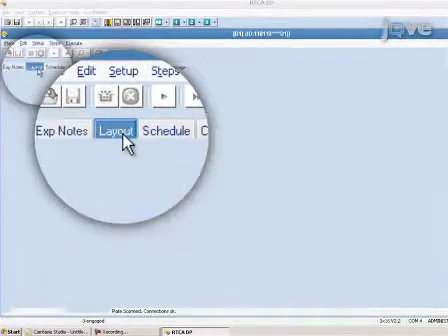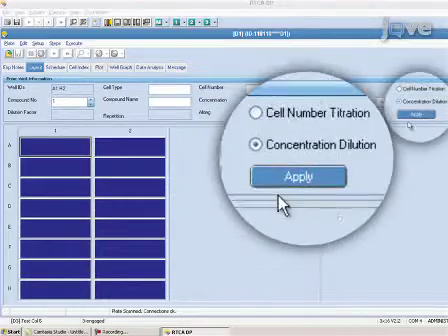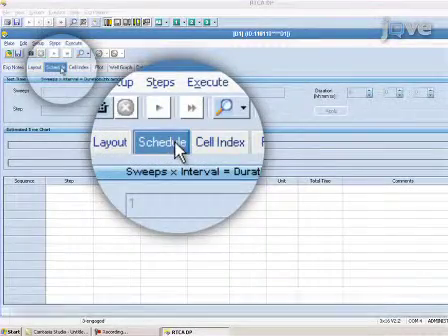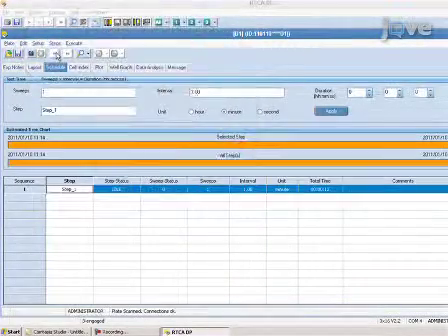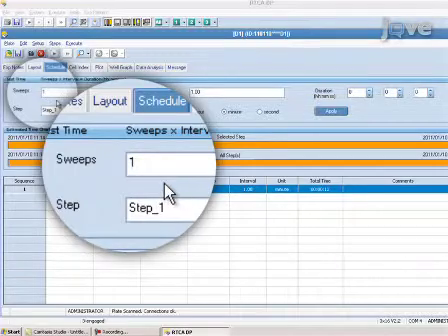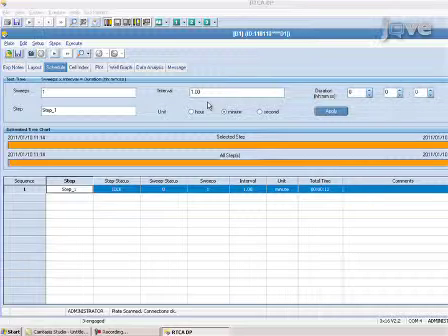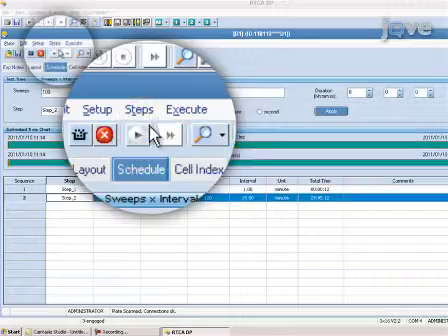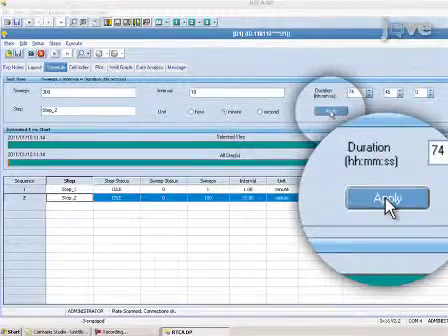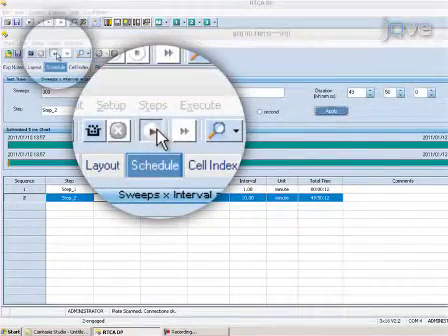In the software window, click on the Layout tab and select the wells containing samples. To program the frequency of real-time data acquisition, click on the Schedule tab, then click on the Add a Step icon. Sweeps indicates the number of readings, and Intervals indicates the time interval between readings. These are automatically set to 1 and 1.00 minute, respectively, which programs the system to perform a background reading. Click on Add a Step and enter 300 in the Sweeps box and 10 minutes in the Intervals box. This will program the instrument to perform impedance measurements for up to 50 hours. To begin the experiment, click on the Start a Step icon. The background impedance of each well will be measured.